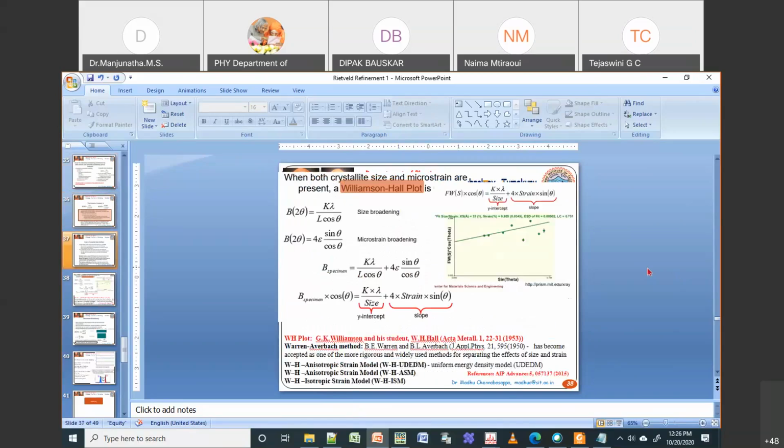And if you do this very well, like as someone asked, if you do all these models, this paper is just based on that model. They don't have any other things. They have taken one example of some nanoparticles, and they have written an entire paper just based on the X-ray analysis, on one single X-ray analysis. So this is how you can actually give a really good explanation. That is what you should be doing.